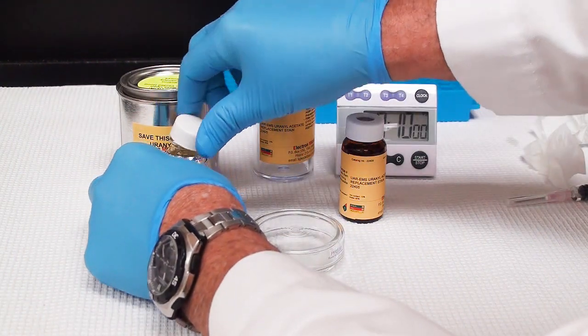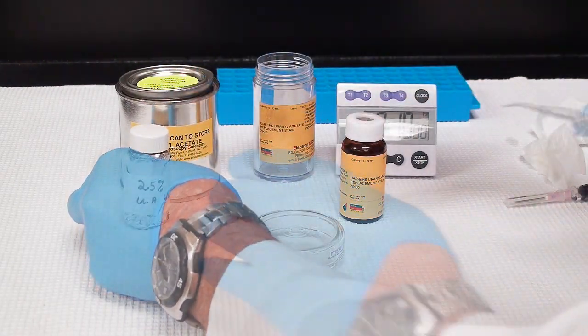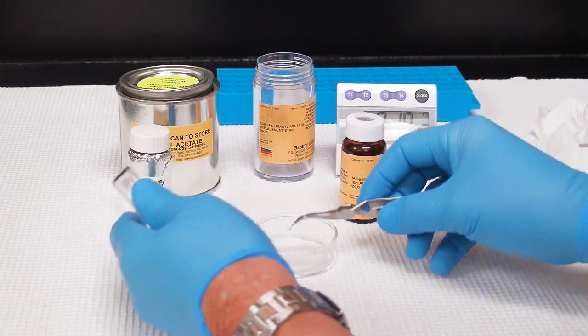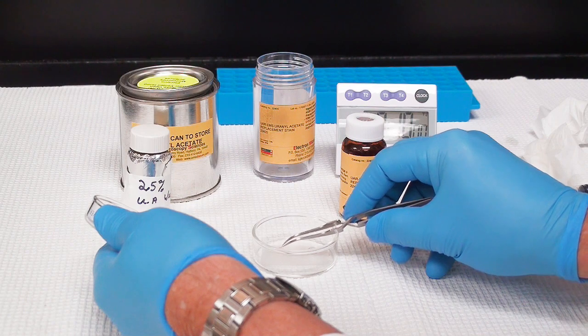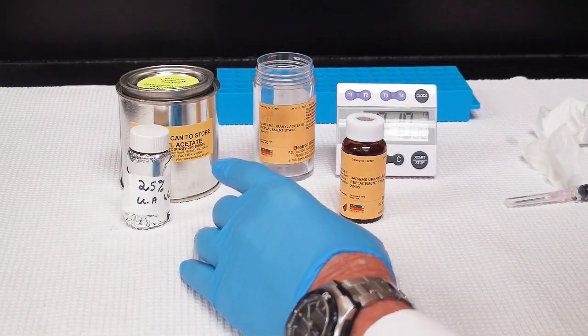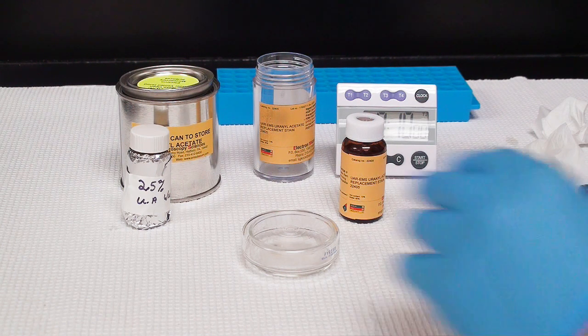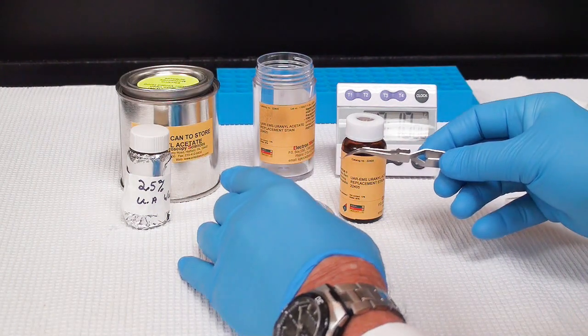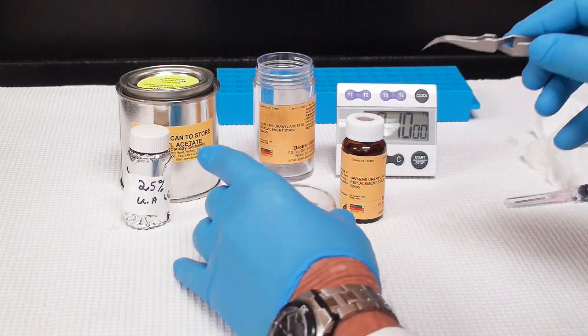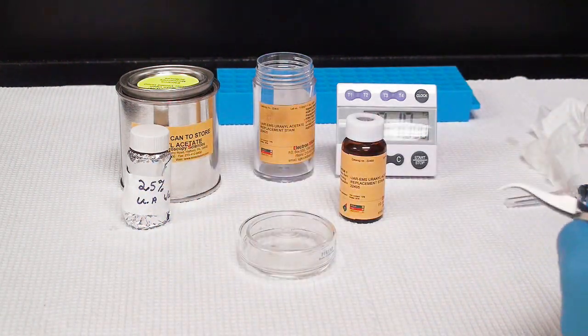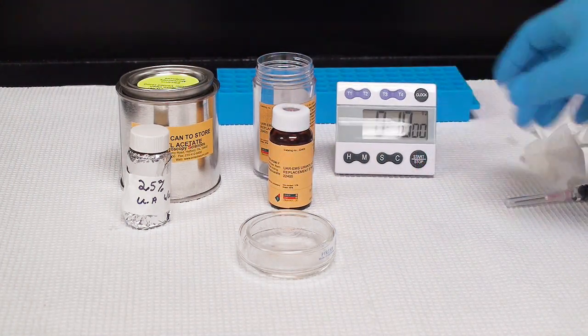I'll save that also for the microwave procedure which will be coming up. We're going to cover that, and then I'm going to do benchtop staining for 10 minutes. Many people use 7, some people use 20. I'll put my uranyl acetate grid on there, and then I'm going to put the uranyl less on the other side.